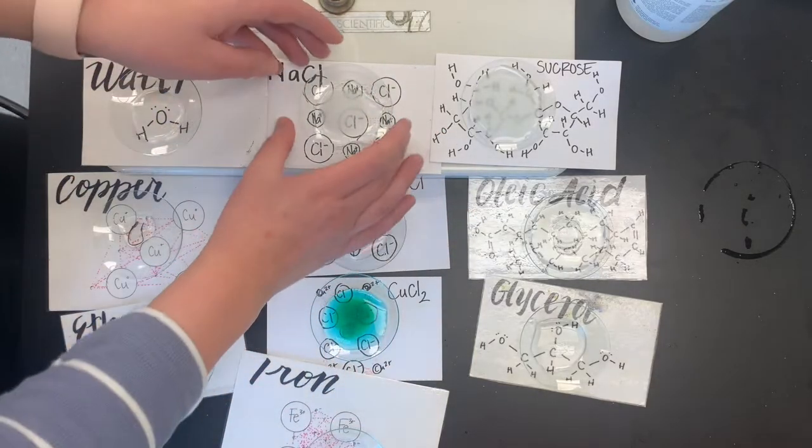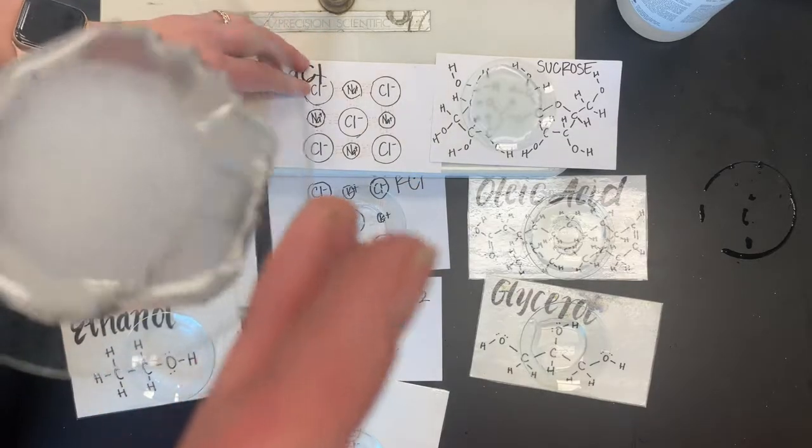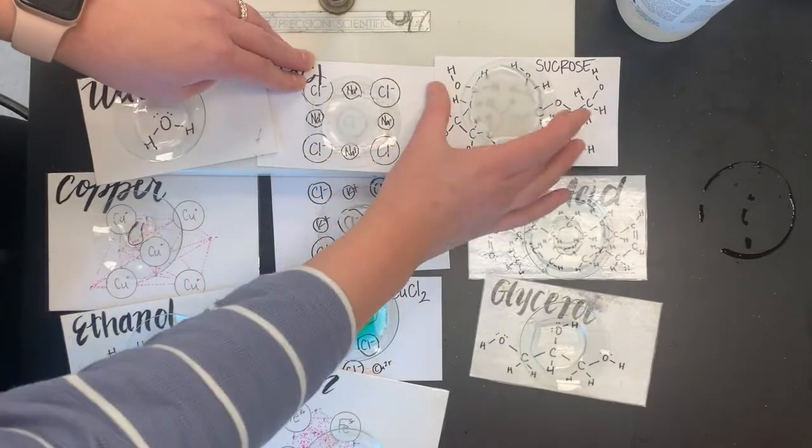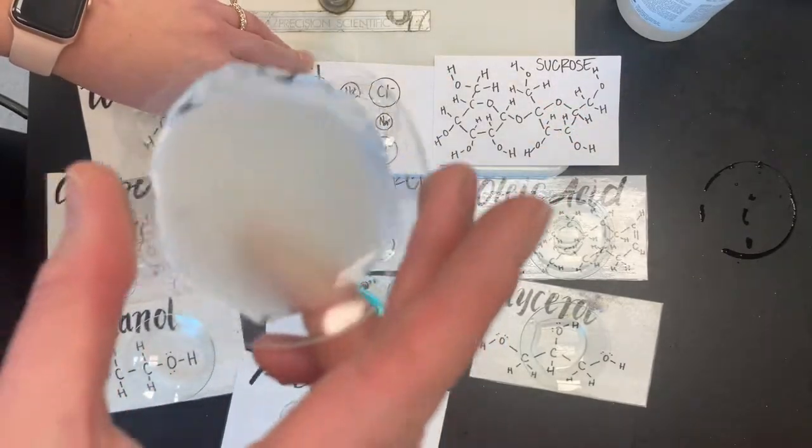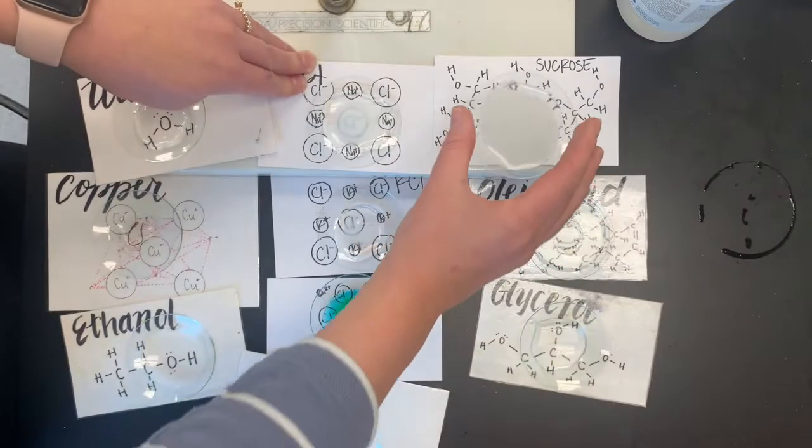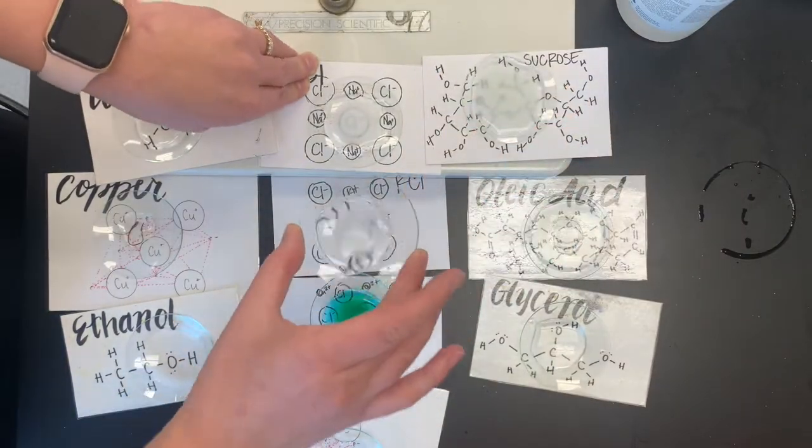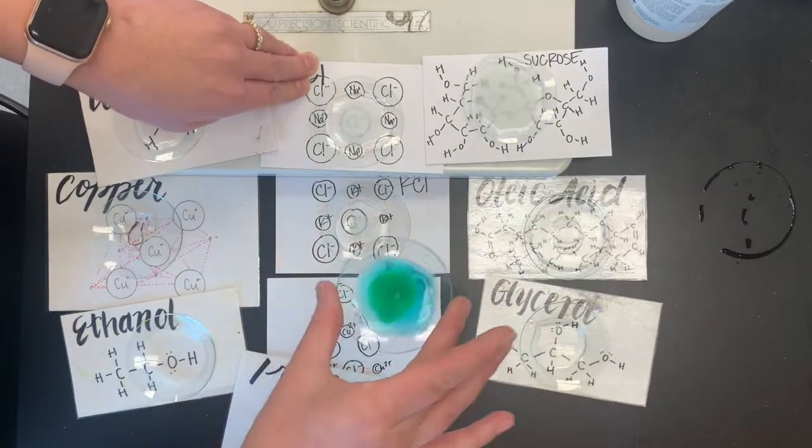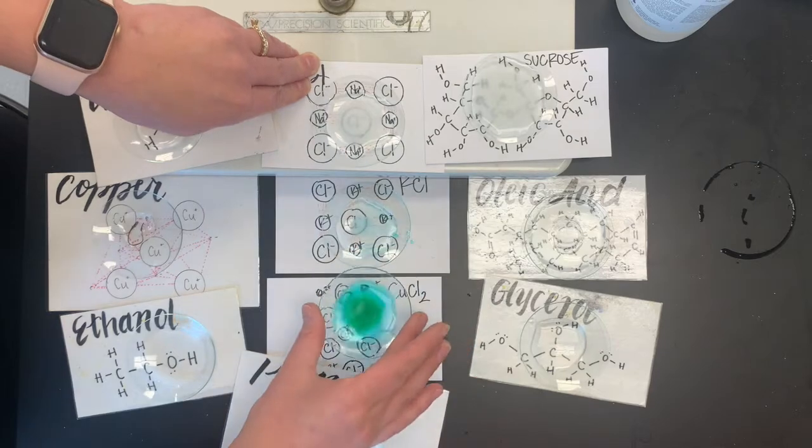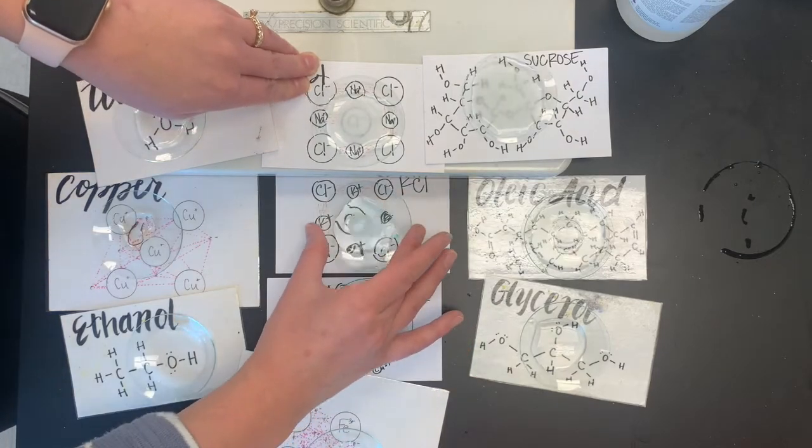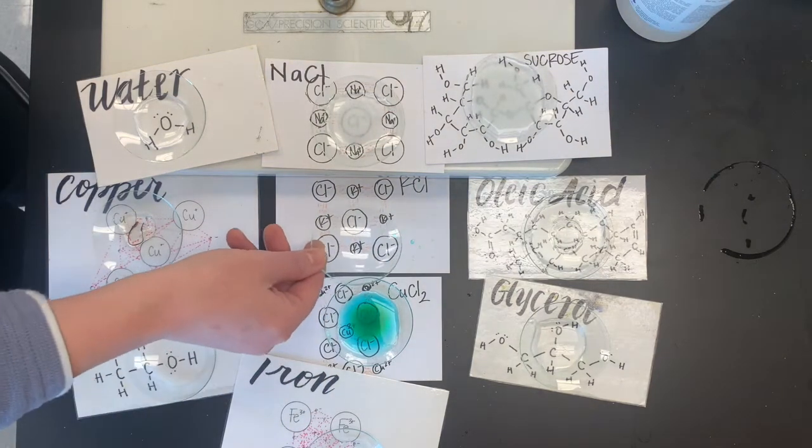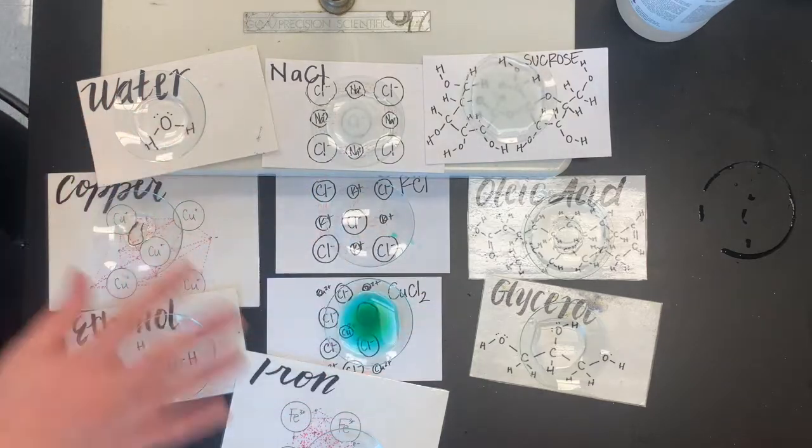Let's go back. There were a few we weren't quite sure about. I would say that, I probably don't have enough water, but some of the salt has definitely dissolved in here. Same with the sugar. We can see it's cloudy, but some of it has definitely dissolved. The KCl, that's actually dissolving pretty well. This is just getting even better, dissolving. Oops. Oh no, I dropped some in there. I'm going to have to redo that test. We'll get that going again. Because next thing we're going to do is now that they've dissolved, we're actually going to test if these conduct.